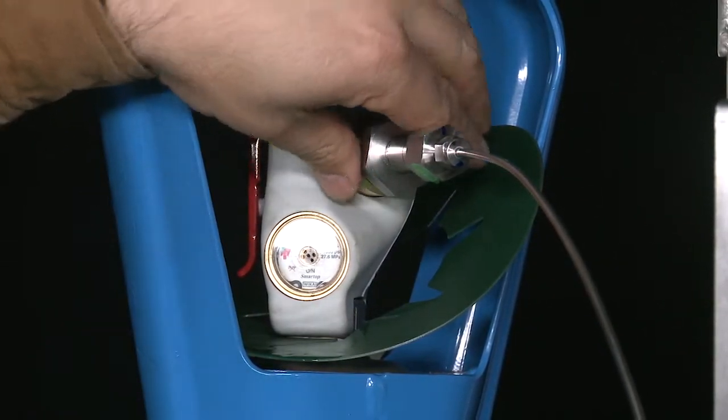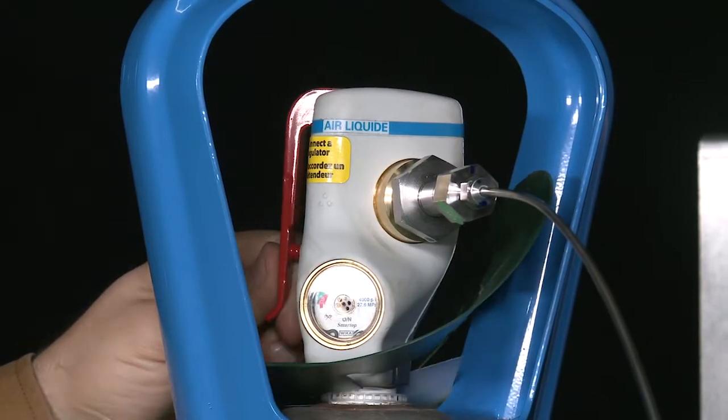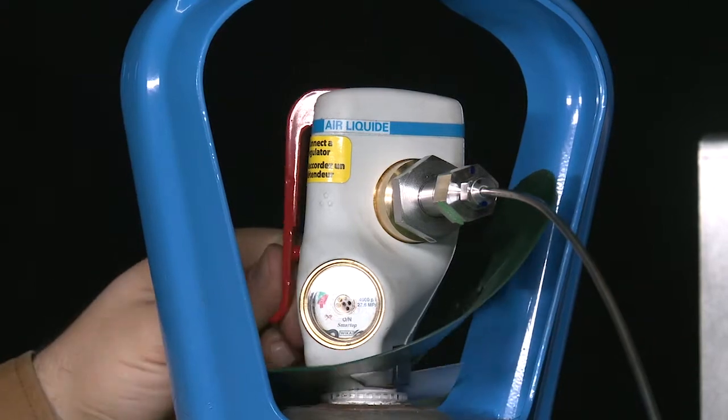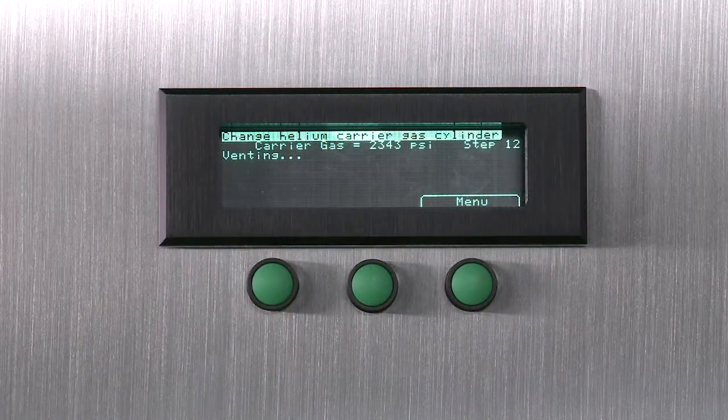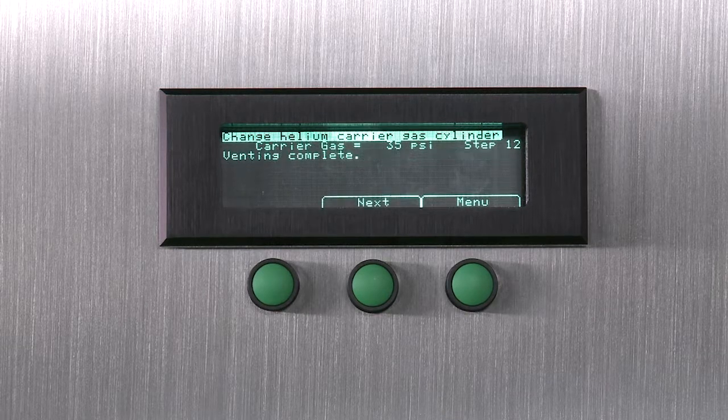Do not open the shut-off valve on the new cylinder. Slightly open the cylinder shut-off valve and close it as quickly as possible. Wait for the venting to be completed. This could take up to 10 minutes.